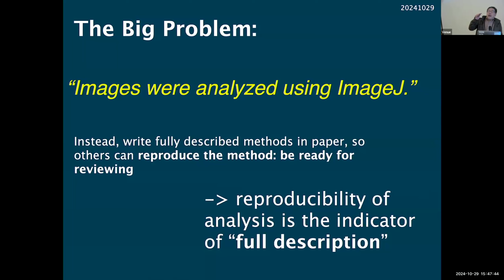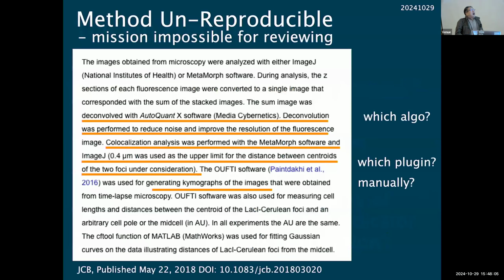So I think there are many ways to control image analysis. So one way is to make some kind of rules, so that the rules say you should do this, you shouldn't do this. But science is not like that. You can do anything but report, including mistakes. And then we want to follow that also with image analysis.